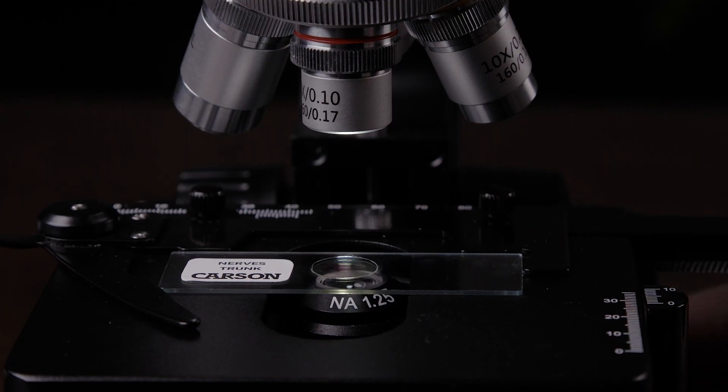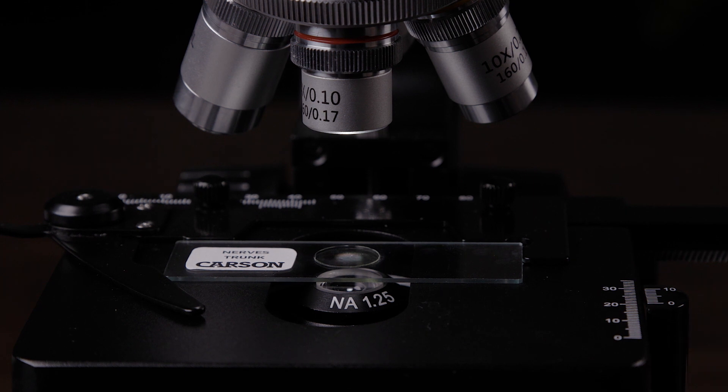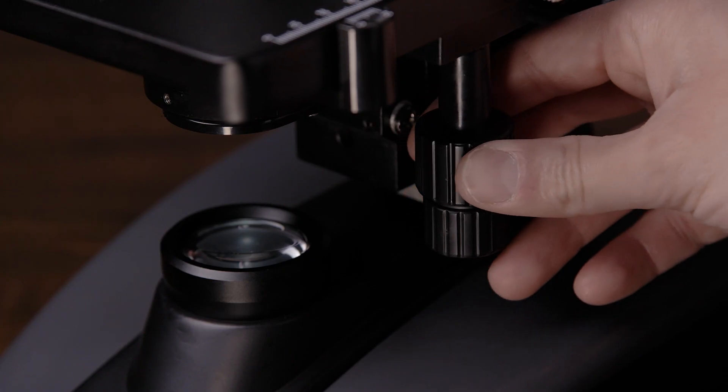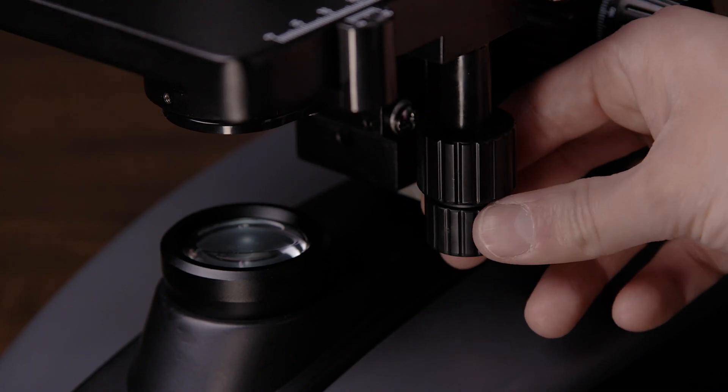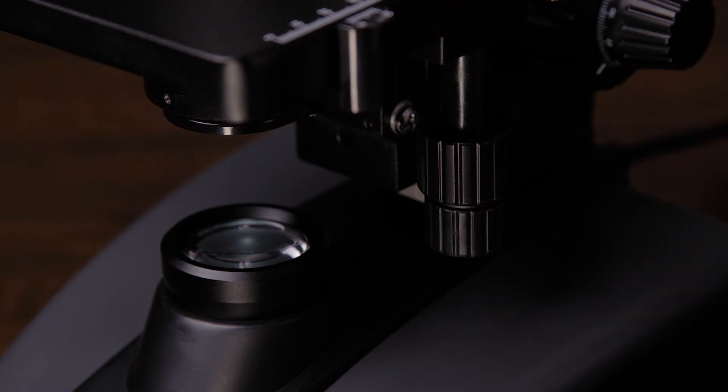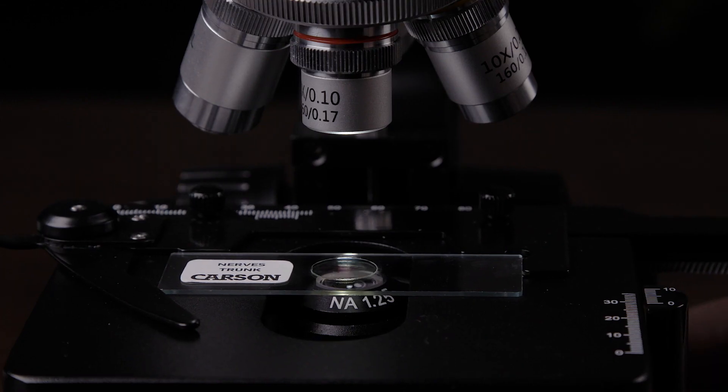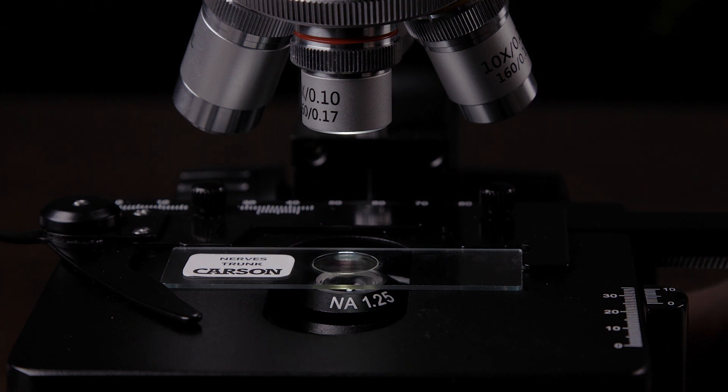Next, adjust and center your slide using the stage. When using the mechanical stage, there are two knobs to move it up or down, left or right. You want to move it so the light is centered on the part of the specimen you want to look at.